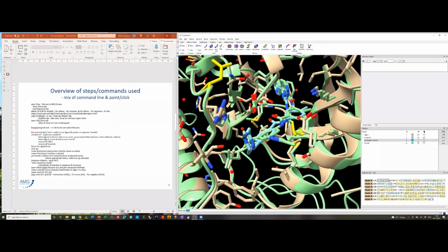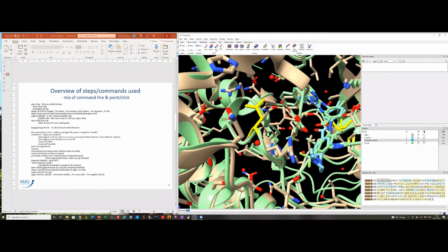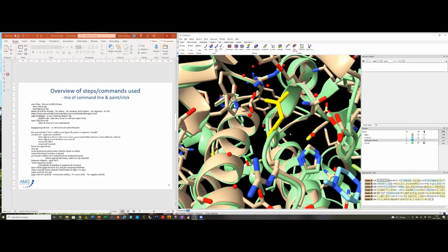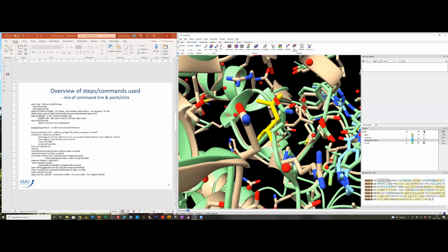I haven't highlighted the structure for this one. If we select that, we can show the atoms of that residue in the nilotinib structure. You can see, so I have to show you the heteroatoms of this one to see that it's different.